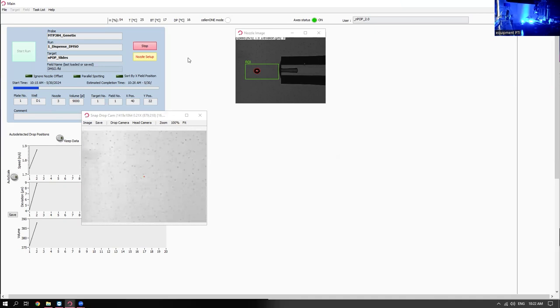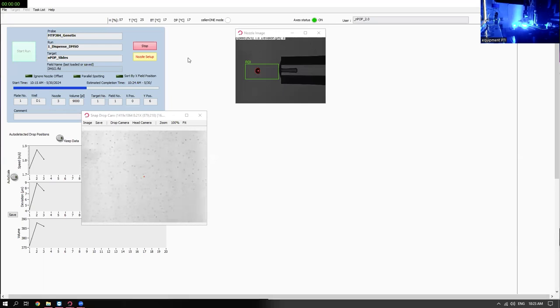So when they're in the tube, I think the cells are sitting on ice over there. In our protocols, we try to prepare the cells within 1 to 2 hours of the cell isolation step. It keeps the cells happy, in general, and it also avoids a lot of absorption of gas. The colder an aqueous solution is, the more gas is solubilized inside of it. Then it's going to come back to about room temperature in the nozzle, and that can cause off-gassing inside of the nozzle, where if there's some nucleation point, an air bubble will form, typically mostly oxygen. That will cause the droplets to be unstable.